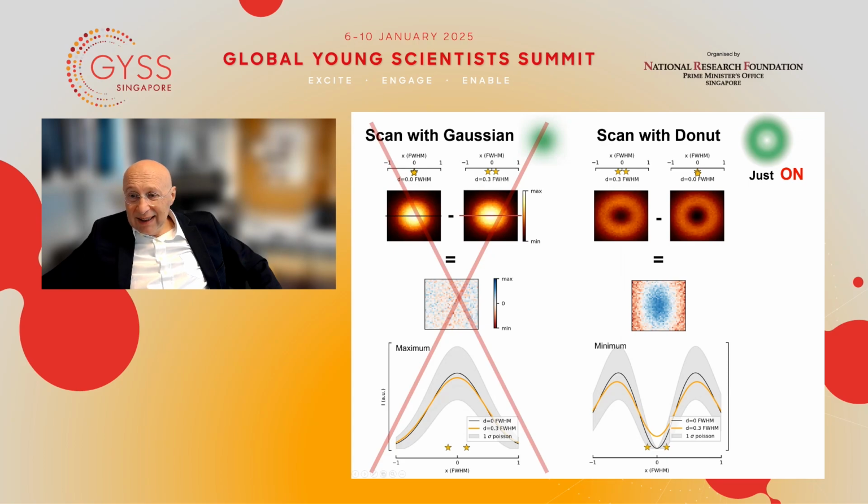So in other words, this distance or difference that we measure between the two is beyond the noise band, as you can see here. So it can be distinguished from noise. And hence, now we can distinguish the two molecules from those where they sit in the same place. Here with the donut, if we scan with the donut, we can separate, whereas here if we scan with Gaussian, we can't. And so we can overcome the diffraction barrier, even though the molecules are emitting at the same time and constantly on.